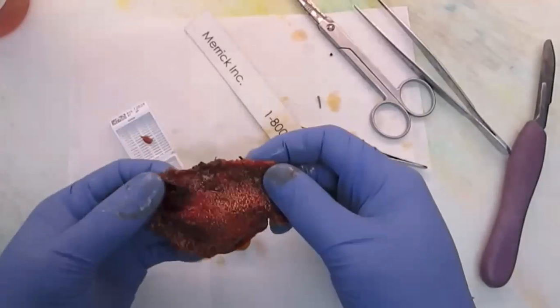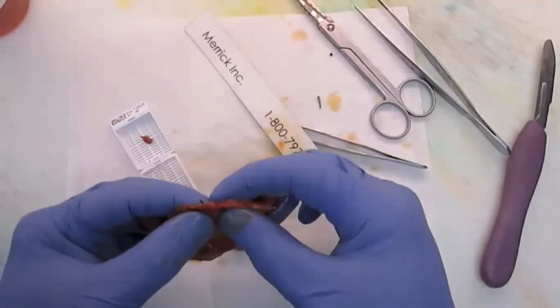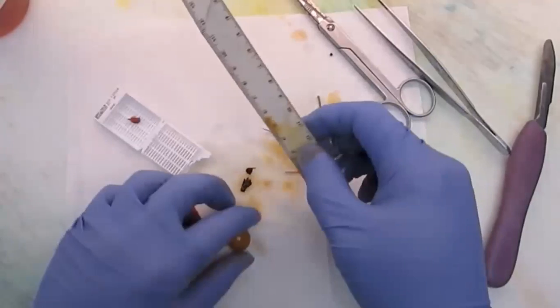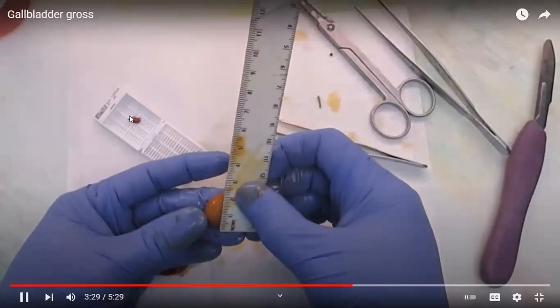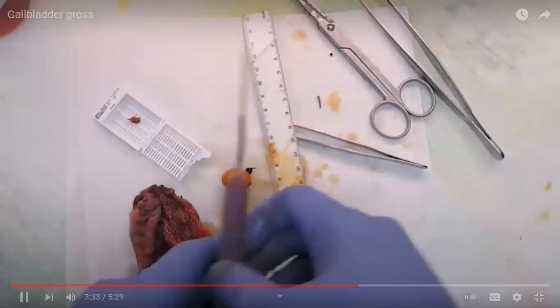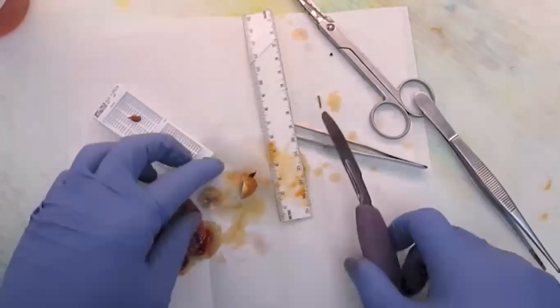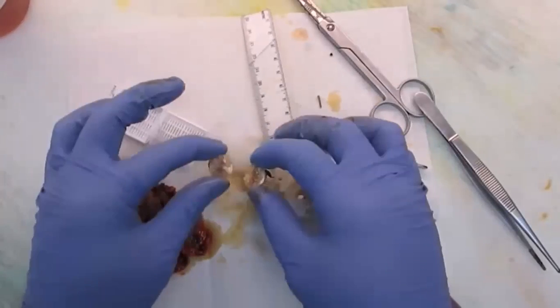The mucosa is red brown with diffuse yellow streaks, and the wall thickness measures up to 0.3 cm, period. Within the container is an ovoid, it's actually the tissue cassette, calculus, 2.0 cm in greatest dimension, close parenthesis, period. Cut surface of the calculus is crystalline with a central dark brown core, period.